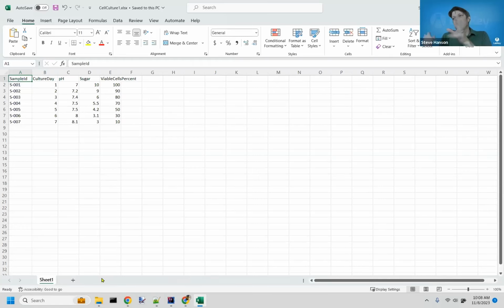You take that database URL and you put it in Tomcat. It's not something you actually do inside the server so much. Then Tomcat will serve the data up to LabKey, and you can see it inside LabKey, surface it as data grids and work with it. So yes, totally possible. People do it all the time. It's one of the best parts of LabKey because you don't have to reinvent the wheel. It's already in a database. Surface it in LabKey. Done. We'll take a look at that tomorrow when we look at database stuff more thoroughly.